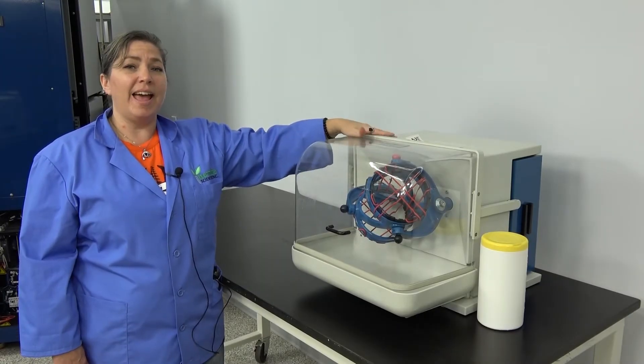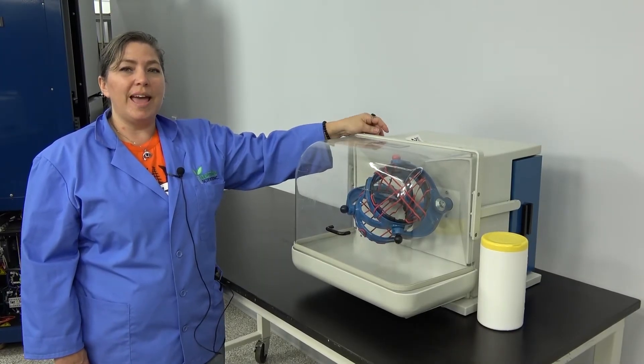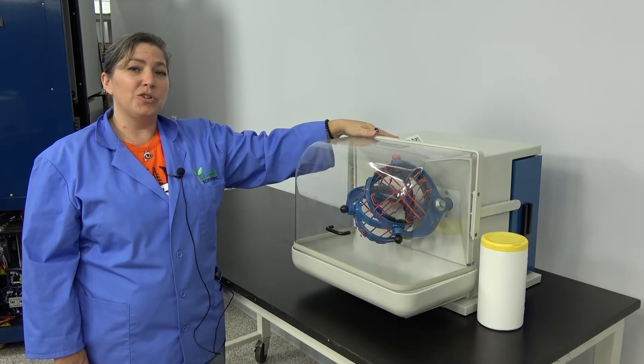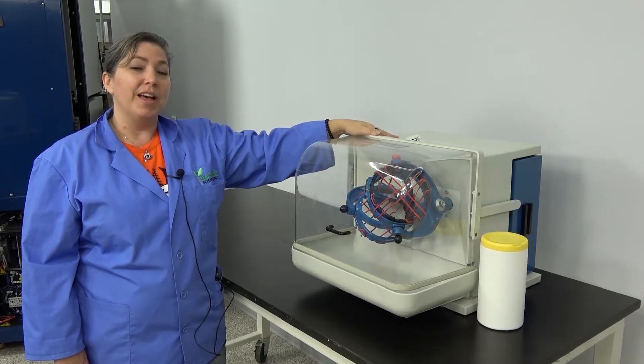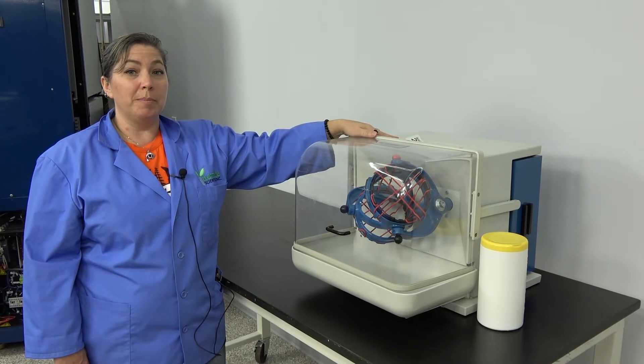Hi, I'm Lori and today I have a Willie A. Bakofin CH4005 Type T2C Turbula Blender.